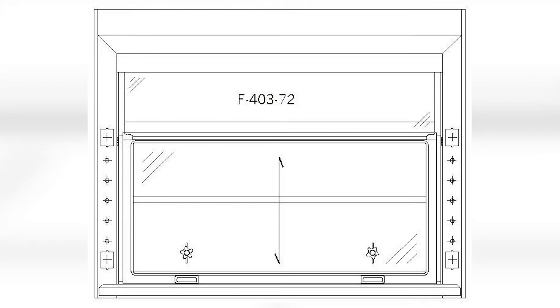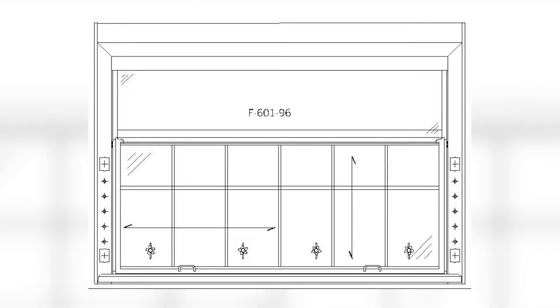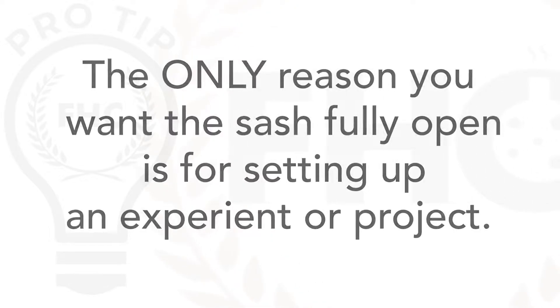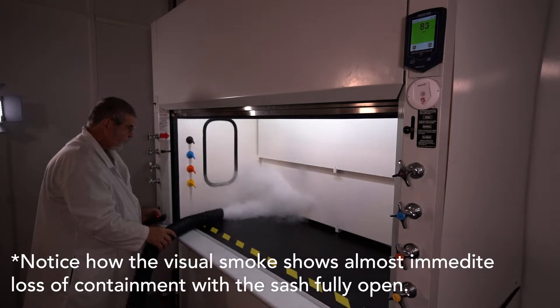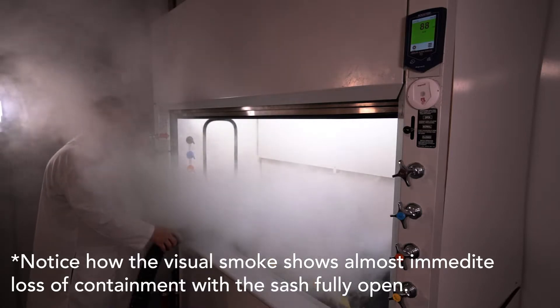There are different kinds of sashes. The most common is vertical rising, which is a single sash glass that goes up and down like a window. Then there are combination or combo sashes, which have sliding panels that move left to right inside a vertically rising frame. Regardless of the sash type, the only reason you want the sash fully open is for setup. A very common mistake is working with a fume hood in the full open position.